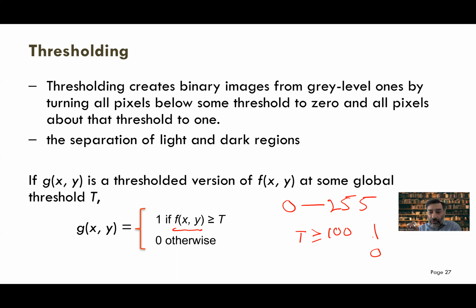And these are really important image types, because you convert to the binary image and then you use these binary images to do a lot of other stuff, right? So that's a very simple thresholding. You come up with a number, and you say that anything above that is 1, anything below that is 0. Now, how do you come up with this number?